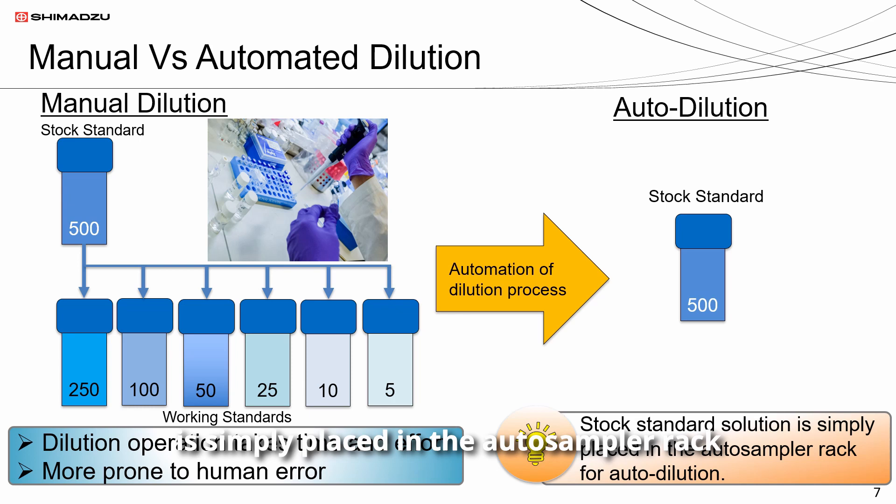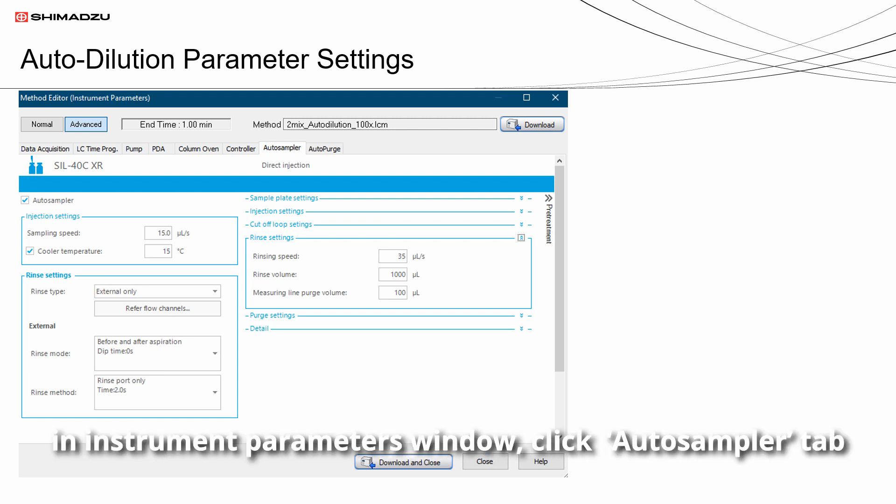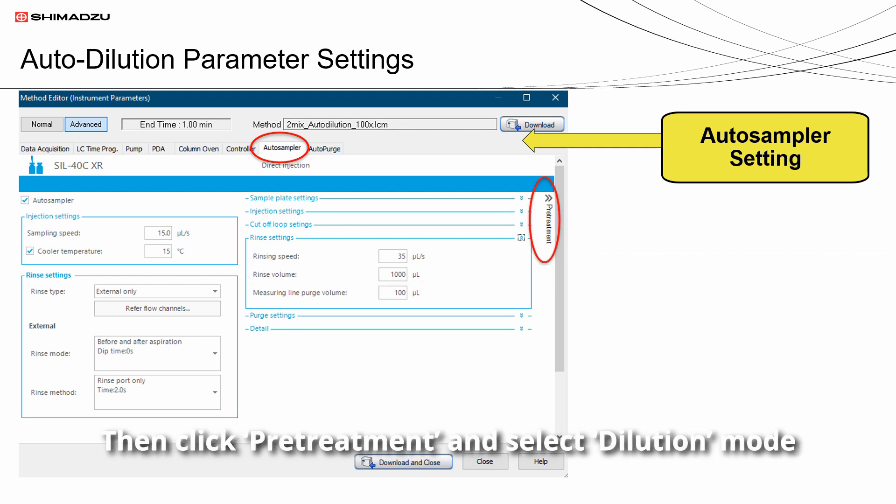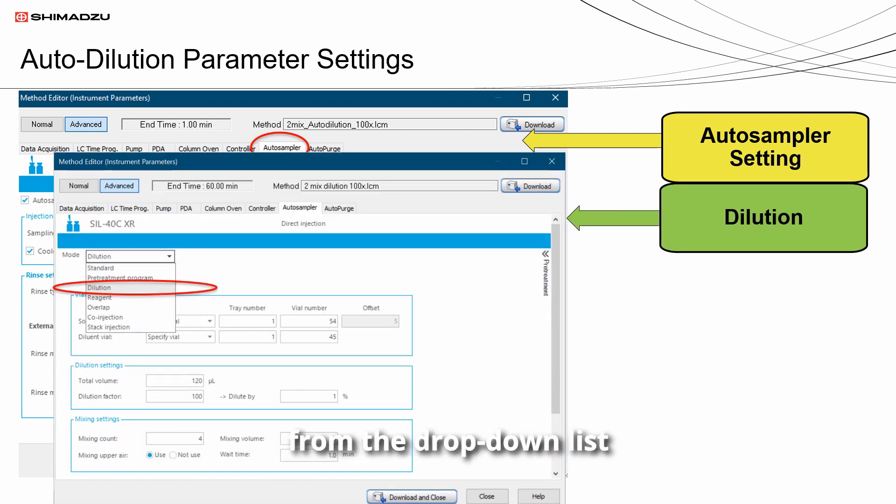To do the auto dilution parameter settings, in the instrument parameters window, click autosampler tab, set the rinse volume to 1000 microliters for each injection, then click pre-treatment and select dilution mode from the drop-down list.